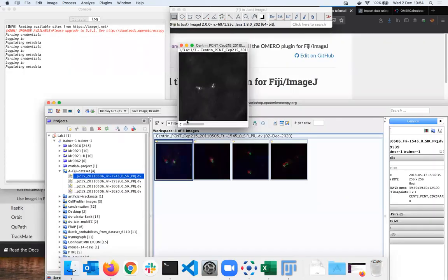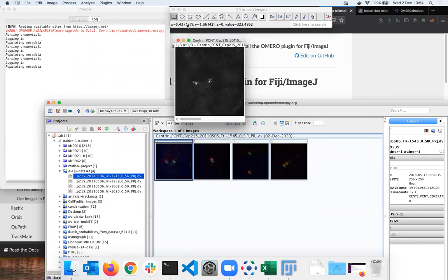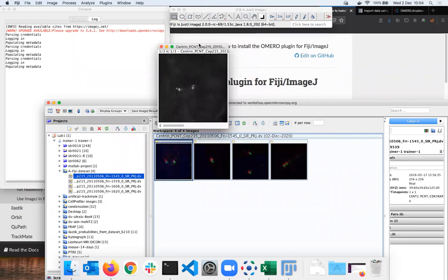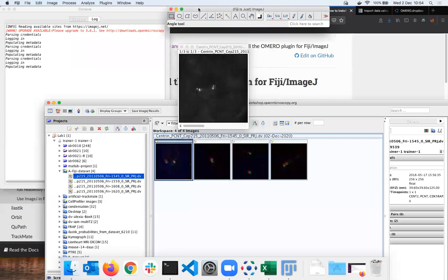So in the web browser, when I clicked on the image in OMERO, things were faster because it is using OMERO API, and if it's a 40 plane image, then it would take just the plane you are viewing right now, and all the 39 other planes will stay nicely in the server down the hill at the University of Dundee. Okay, this is not the case for Fiji. It must fetch the whole thing. But for that, once it's done, this image is fully in Fiji. So all the power and magic of Fiji with respect to analysis, which is very superior to OMERO analysis, is capable to be unleashed on this image.